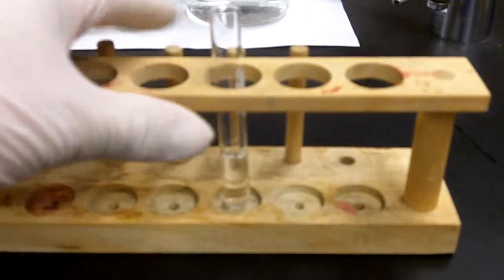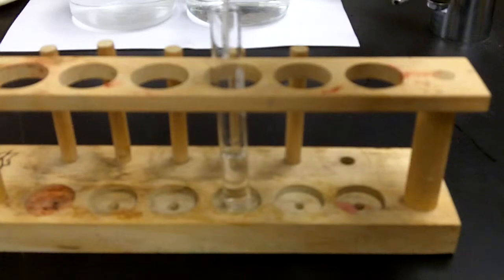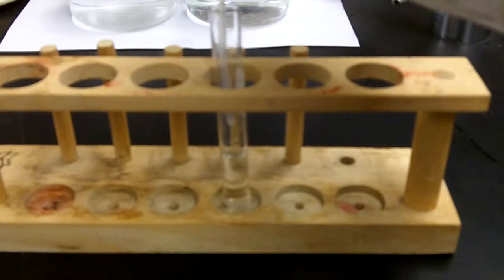I'm going to add the hydrochloric acid when the test tube is in the test tube rack. Drops going in, looking in the solution and the bottom of the test tube.